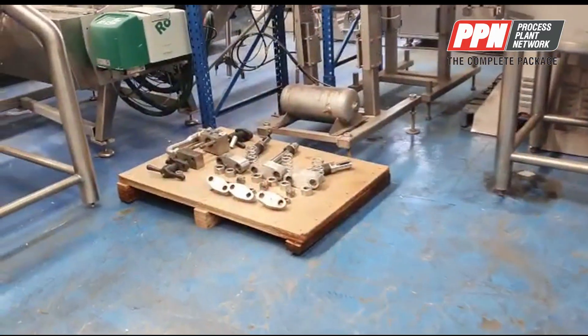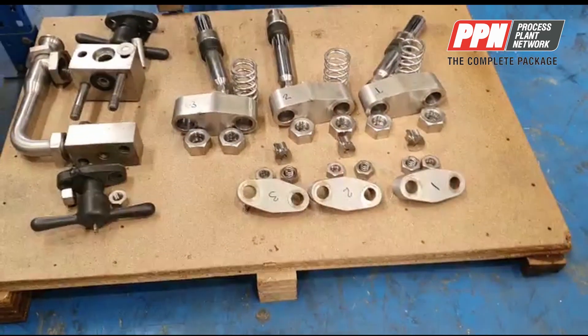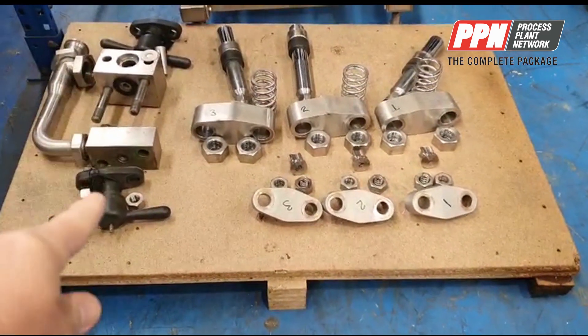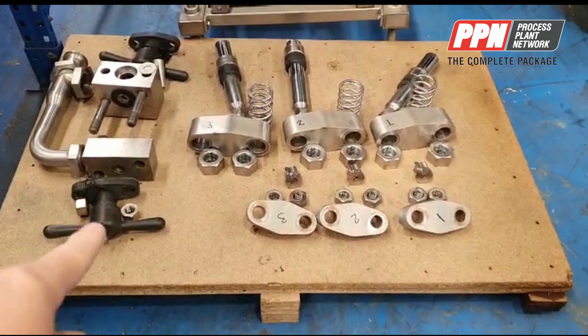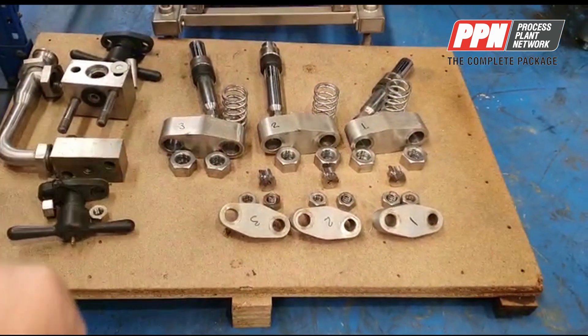These are the components we've removed so that we can successfully dry run for you. You can see the first and second stage there with the handles to adjust the pressure, and there are the poppet valves and the pistons.